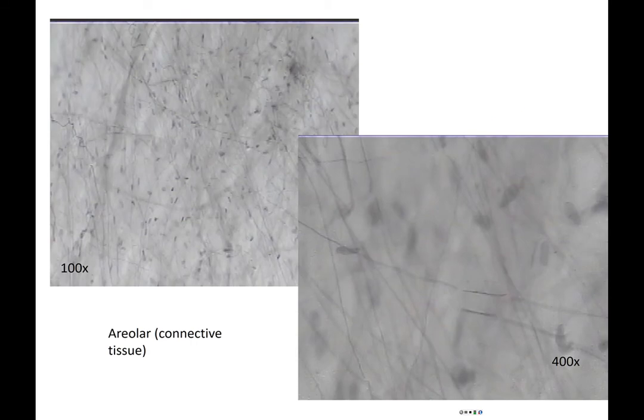The first of the connective tissues that we're looking at is called areolar tissue, and so this is kind of our generic loose connective tissue. You have all of the different types of fibers in this tissue and lots of different types of specialized cells. I really like showing this slide at the 100x magnification. Once it gets to the 400x magnified it begins difficult to get everything in focus on the microscope. To some extent I've had students describe this as like spaghetti and meatballs, so if that helps you to identify it. Areolar tissue is going to be widespread throughout the body so we'll see this lots of different places. One place that's probably good to memorize at this point would be the dermis. So the dermis is one of your layers of the skin.